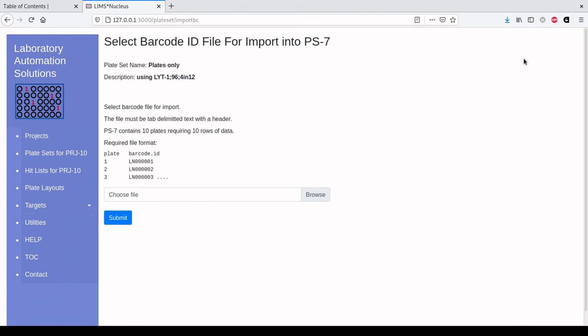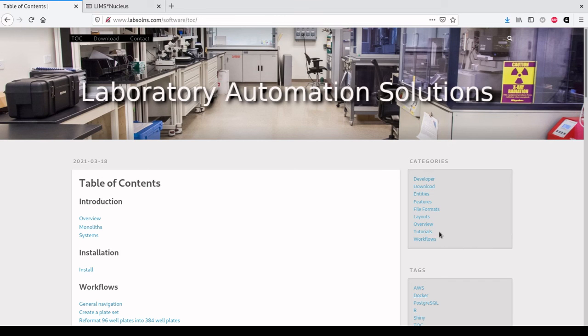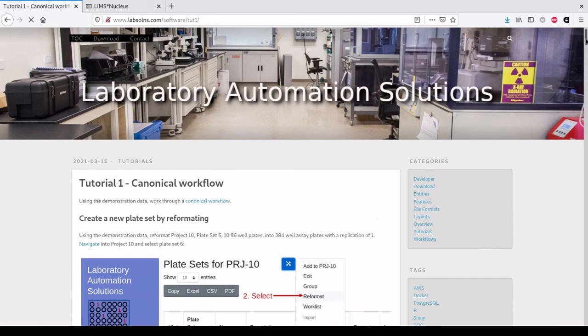If an action involves importing data, you will be presented with a sample of the first few lines of the import file. Note that column, label, spelling, and capitalization are critical for all imported data. Warning messages will attempt to diagnose formatting problems for you.